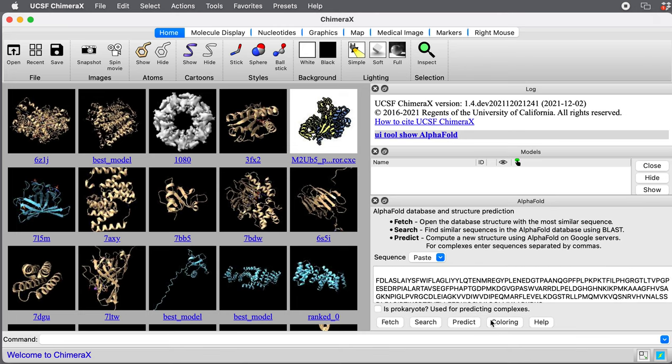Before pressing the predict button, there's a check button down here that says "is prokaryote." This is a bacterium, a prokaryote. We're going to check that. This affects how AlphaFold runs and how it finds ortholog sequences.